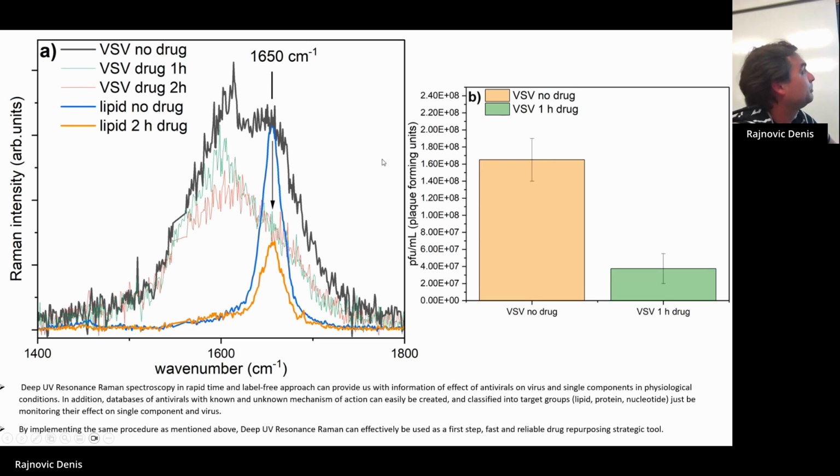But for this procedure, you need, let's say, very fast results. In 2 hours, you can get some indication of how this drug works, while in this case, there was a collaboration between multiple laboratories, which could take weeks.